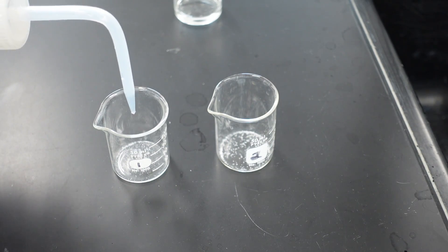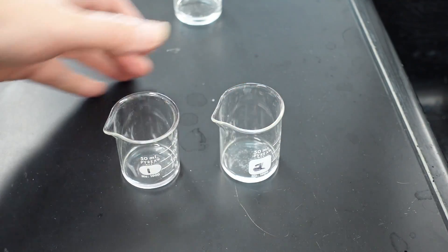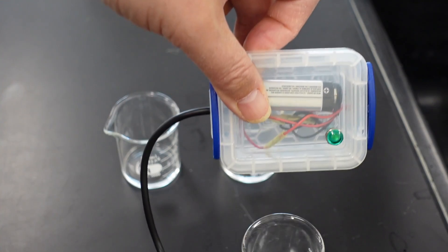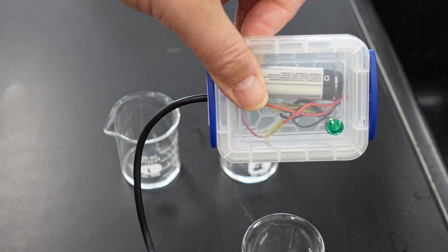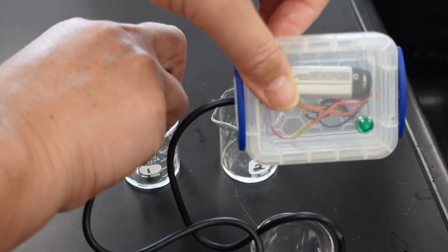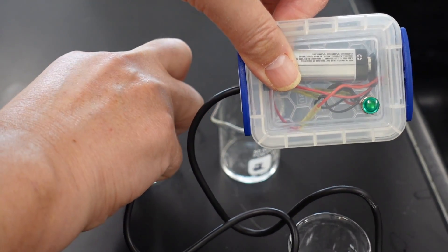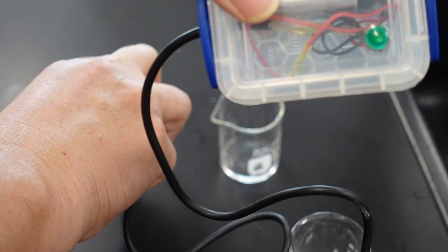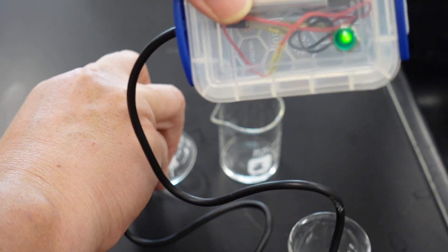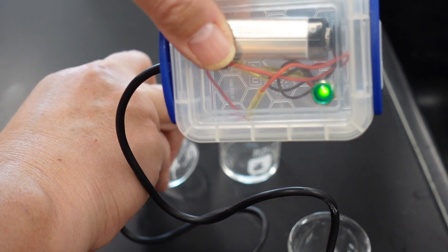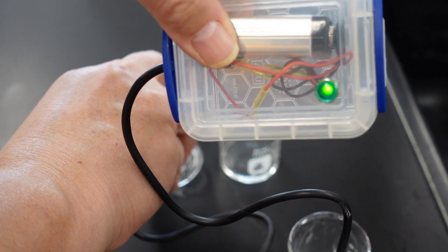So now let's dissolve each of these substances in a little distilled water. Now get ready to test the conductivity. First, we will have a look at substance one. Bright glow or dim glow.